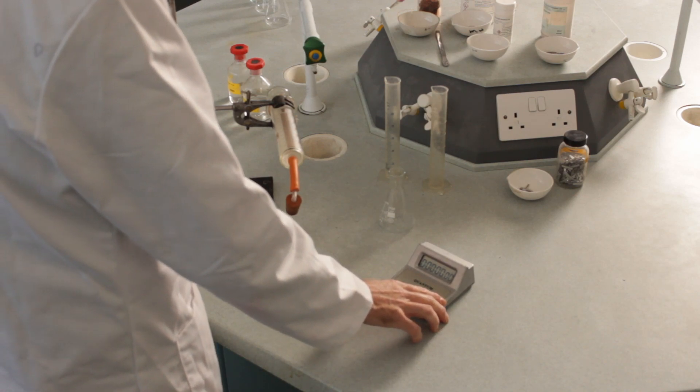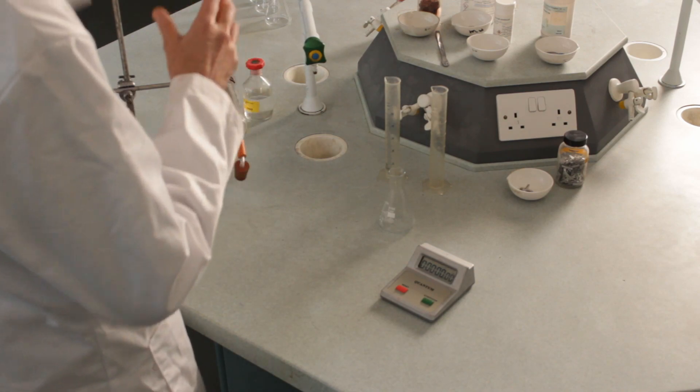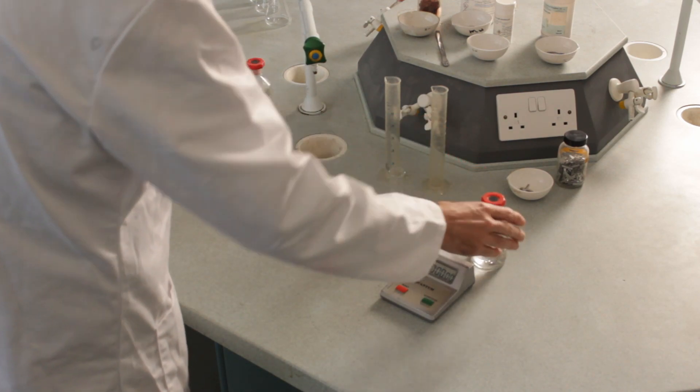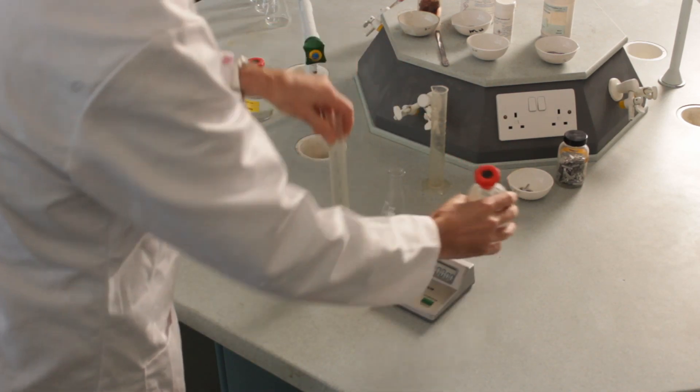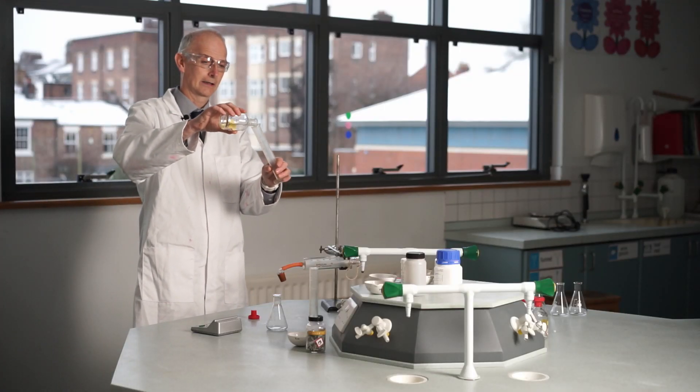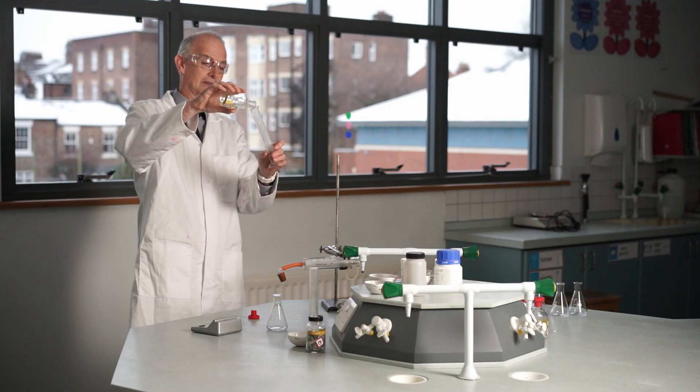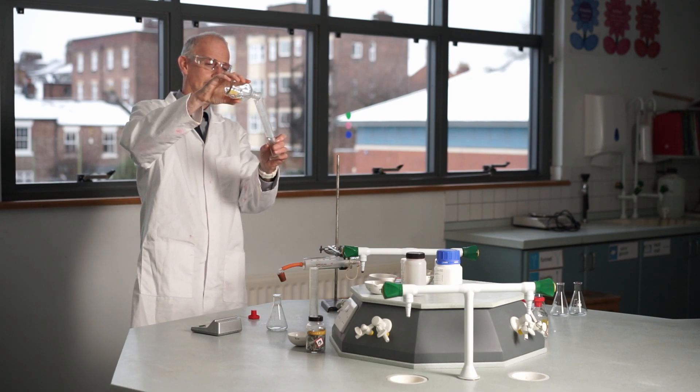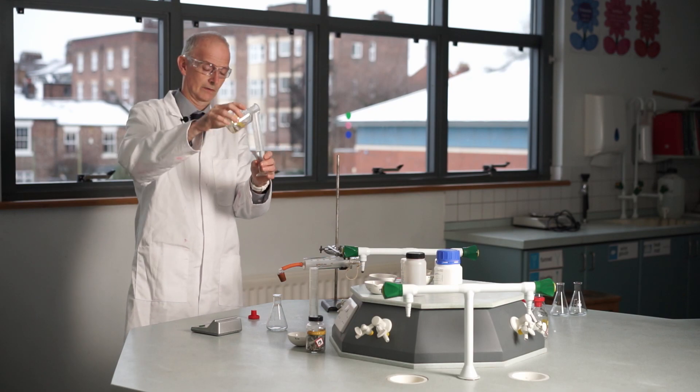And the acid I'm using is hydrochloric acid. And I'm going to be using 25 centimeters cubed of hydrochloric acid. So I can pour this out with the measuring cylinders. So it's basically half a measuring cylinder.